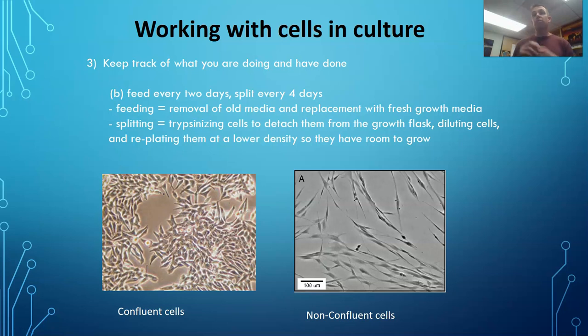So basically, unfortunately, that means over the next 6 weeks, you and your partners are going to have to take turns and come in and either feed the cells or split the cells, depending on which days it is. All right? But that will really get you some great experience with tissue culture, and we will use these cells.